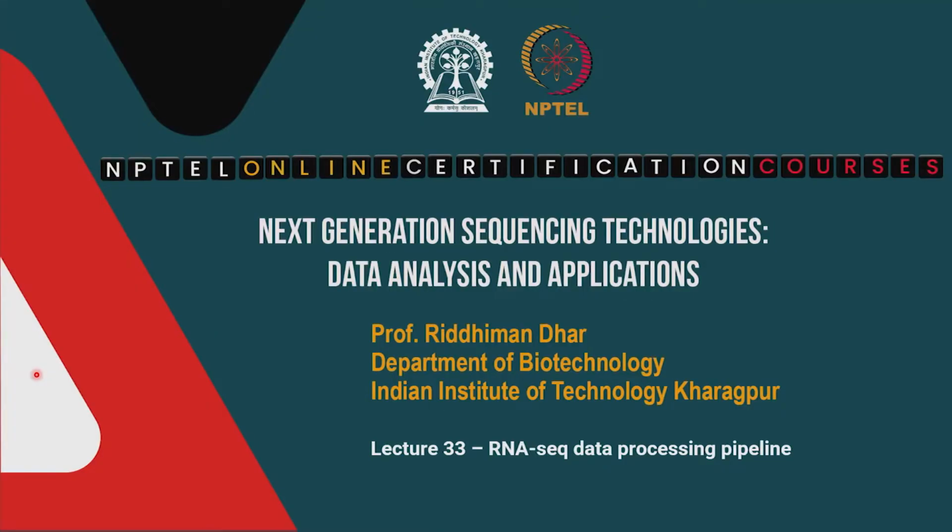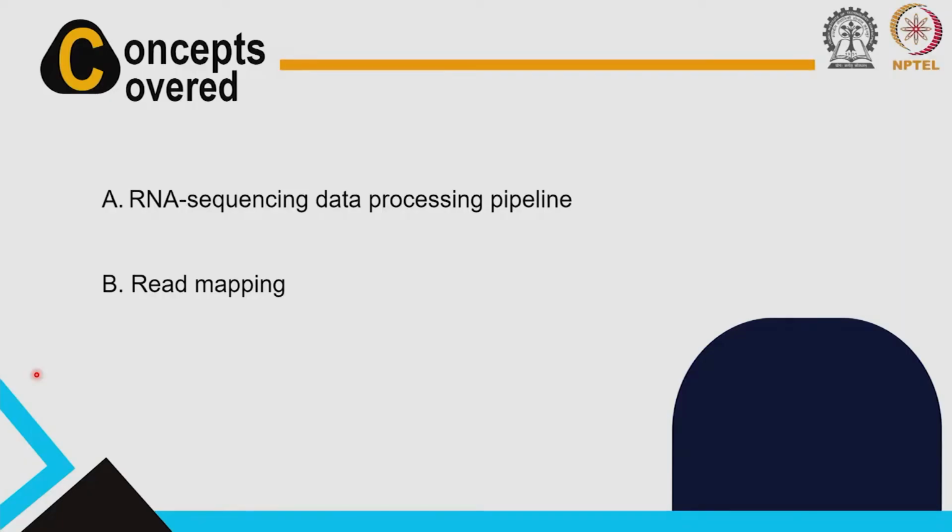How do you actually process the data? How do you set up the pipeline and what kind of tools and methods do we use? We will discuss this in theory and alongside we will also have some hands on. I will show you the tools, and at the end we will also have a hands on of differential gene expression analysis, where we will use these tools to actually analyze a real data set and identify genes that are differentially expressed between two samples. Okay, so, these are the concepts that we will be covering in this class.